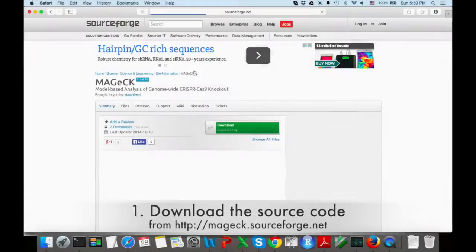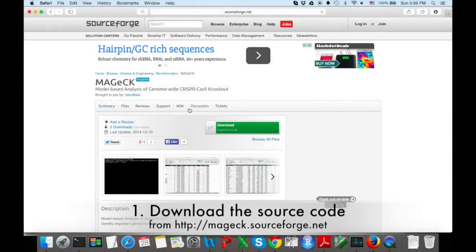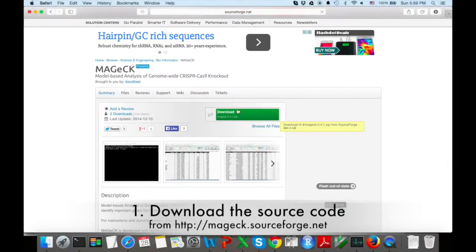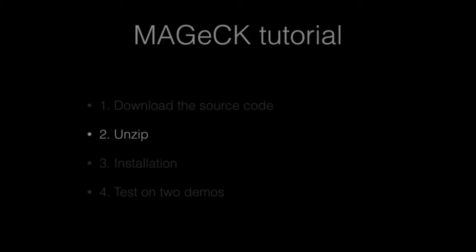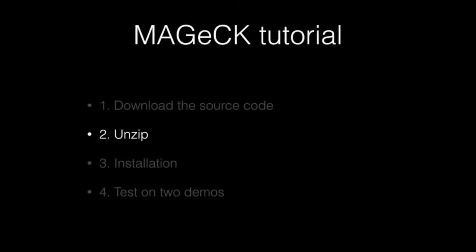The first step is to download the source code from mageck.sourceforge.net. The second step is to unzip the source code.